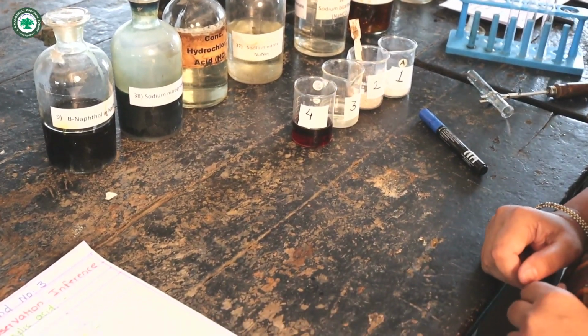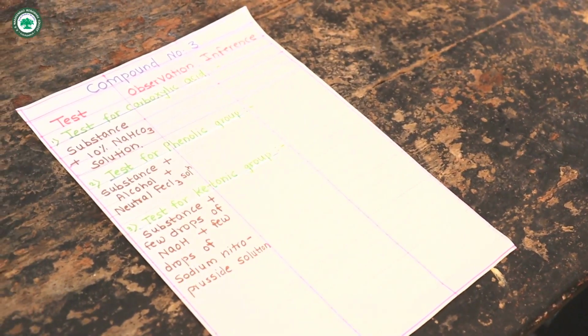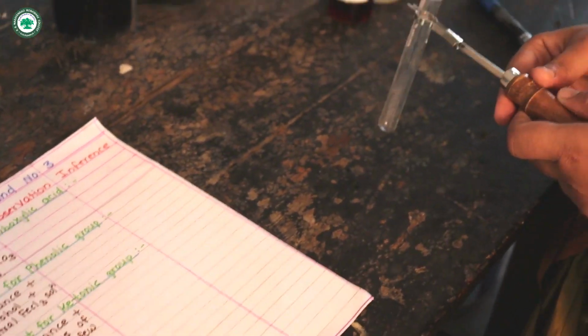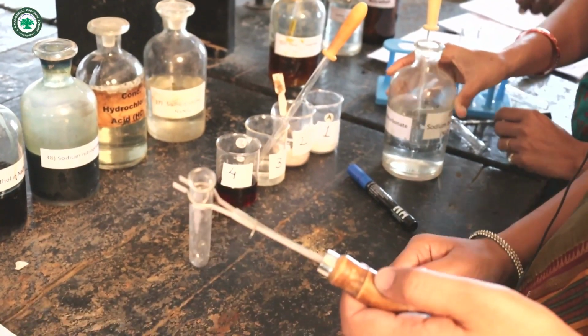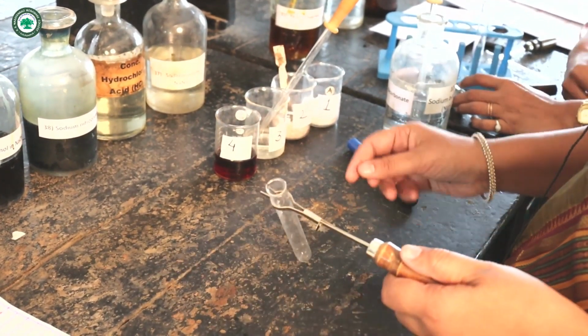For compound third, we have to perform all tests: carboxylic acid, phenolic, ketonic. First test is substance plus sodium bicarbonate for carboxylic acid. Again, take a clean and dry test tube with test tube holder.